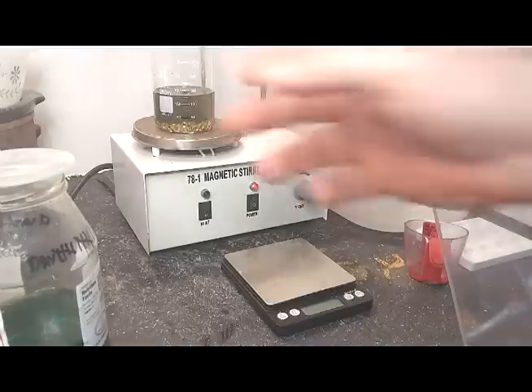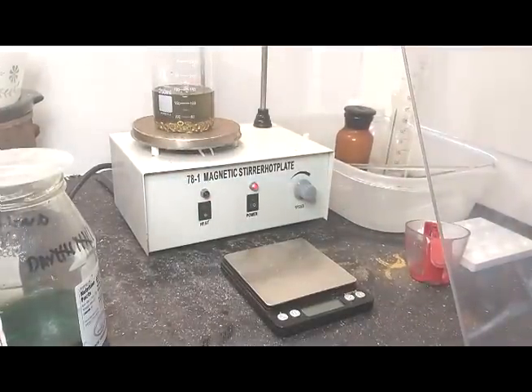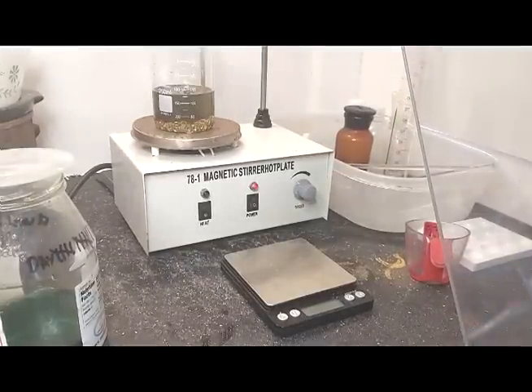We have to wait and see if in a few hours, or God forbid a few days, we come back and see gold foils floating in the solution. And that's about it.